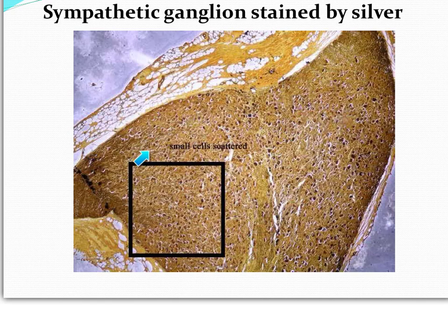Do you have a synapse in this ganglia? Yes, there is a synapse. We have a preganglionic and postganglionic. What is the type of the nerve fibers here? We have here the postganglionic fibers, which are unmyelinated nerve fibers.